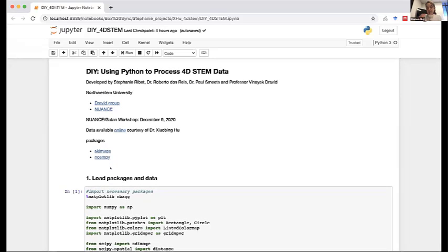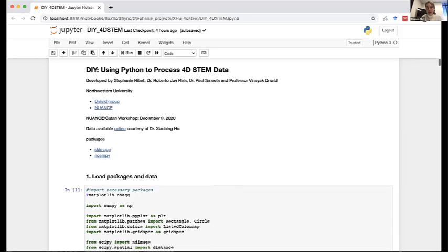So the basic outline of what I'm going to go through is first just how we load the data into Python, then some basic cleaning, like Roberto just talked about, and then we'll go through the analysis in two stages. First, some more basic analysis, and then some more advanced techniques. I'll pause in between, Roberto, to see if there are any questions or confusions that we can clear up between steps, if there's anything that comes in the chat.